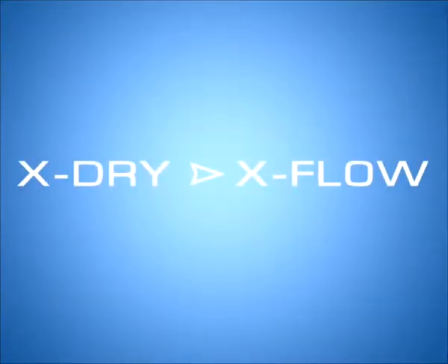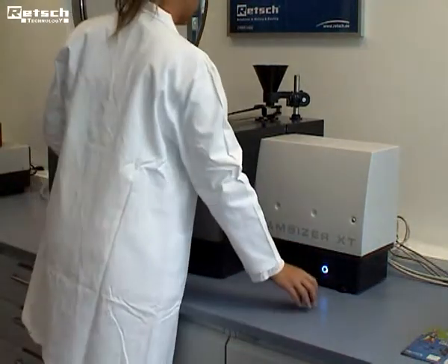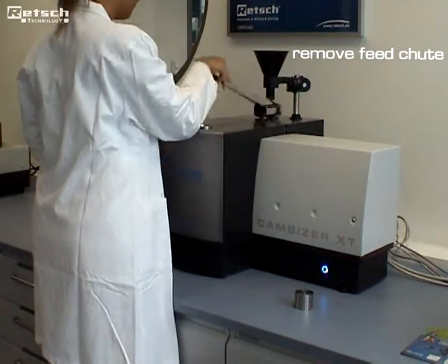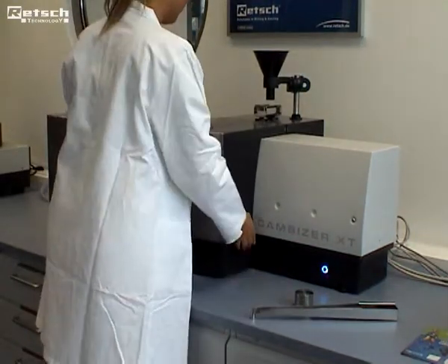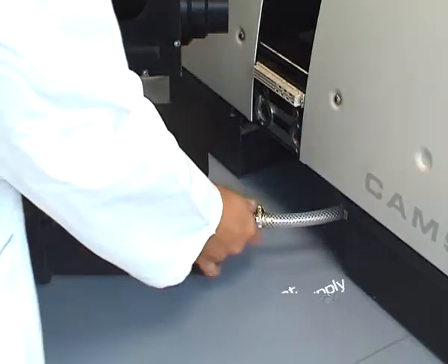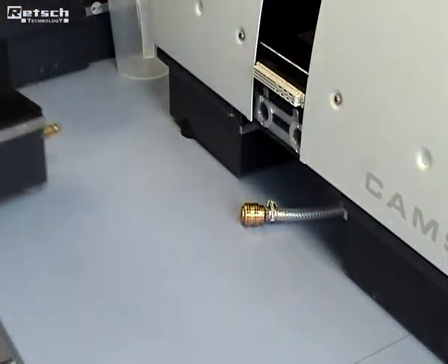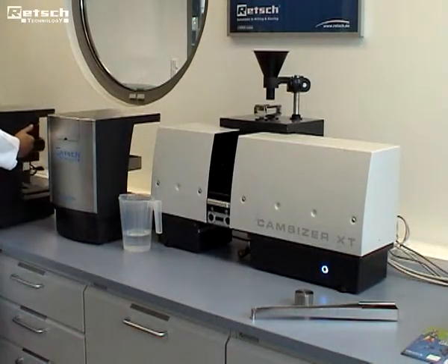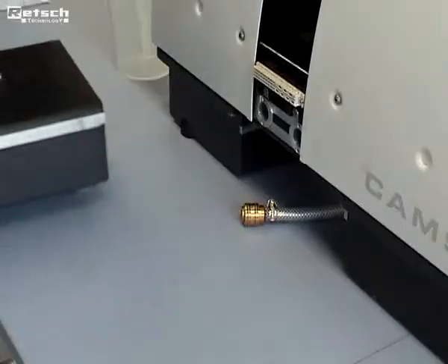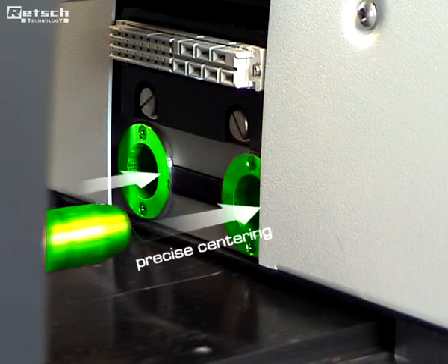Now we will demonstrate the change from Dry to Wet measurement. After having removed the feed chute, the complete X-Dry module is extracted from the CamSizer XT. The compressed air supply is disconnected from the quick coupling. The X-Fall wet module is centered via the guide bars, precisely in the correct position.